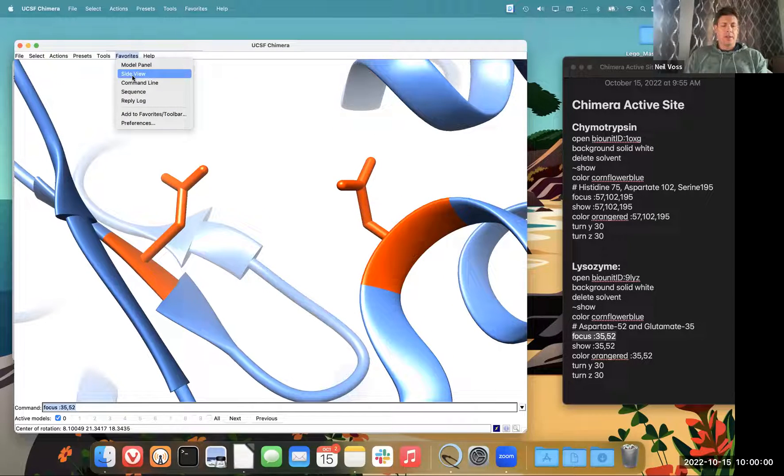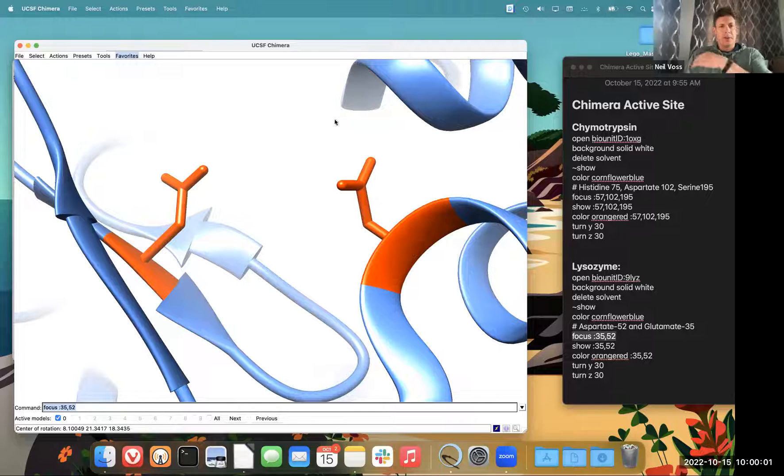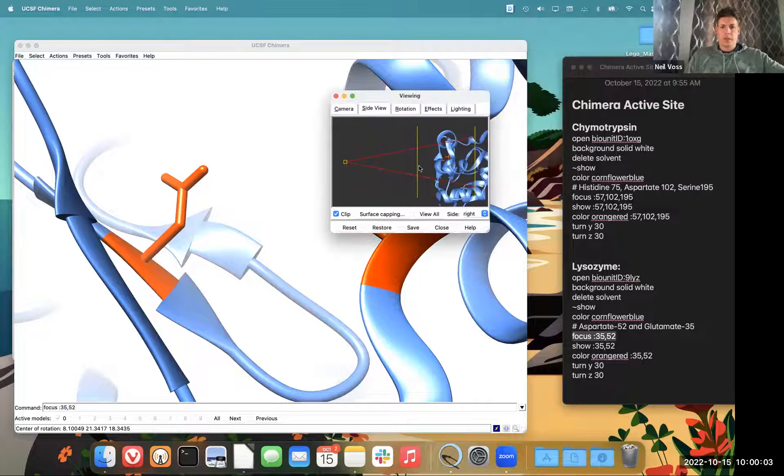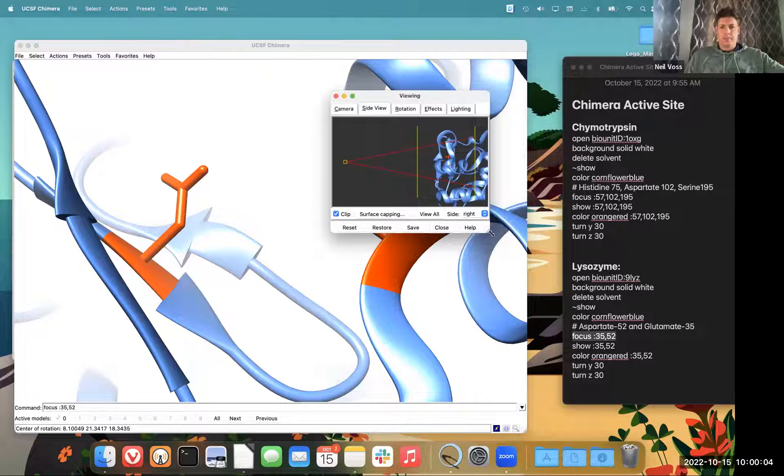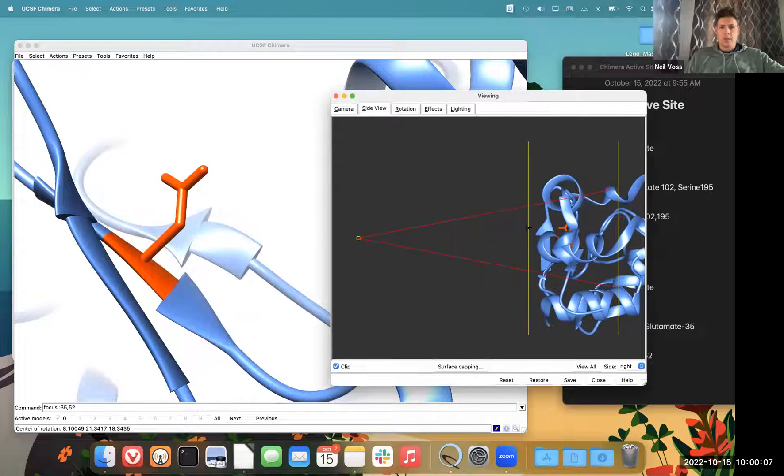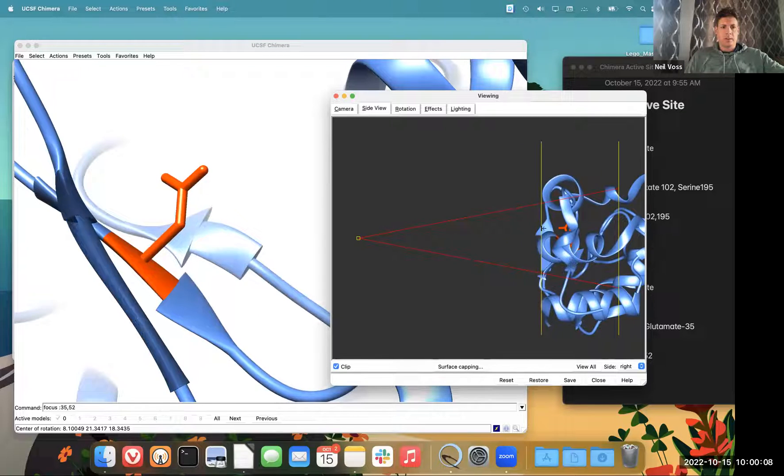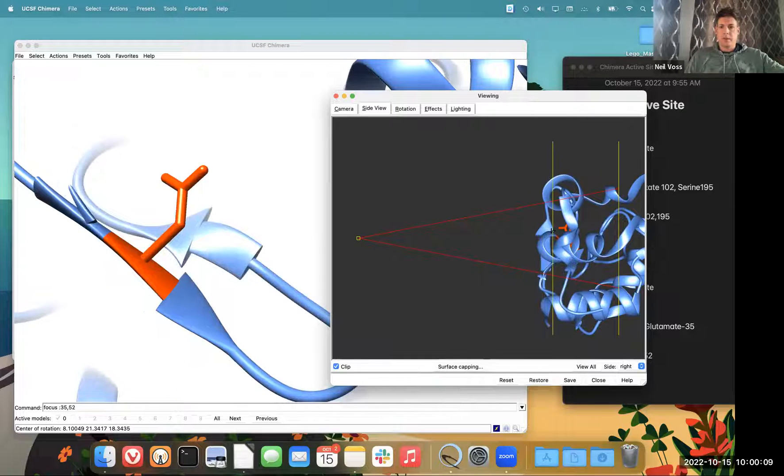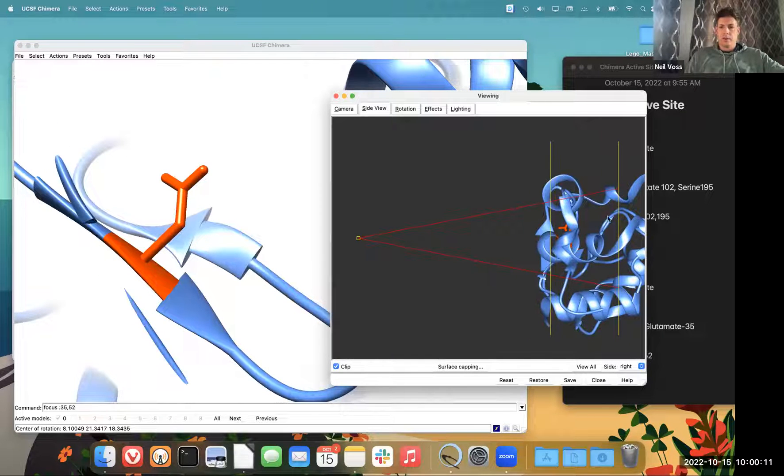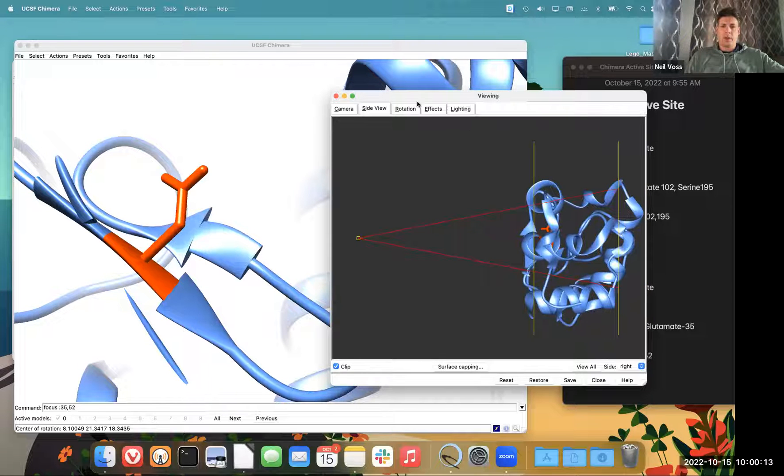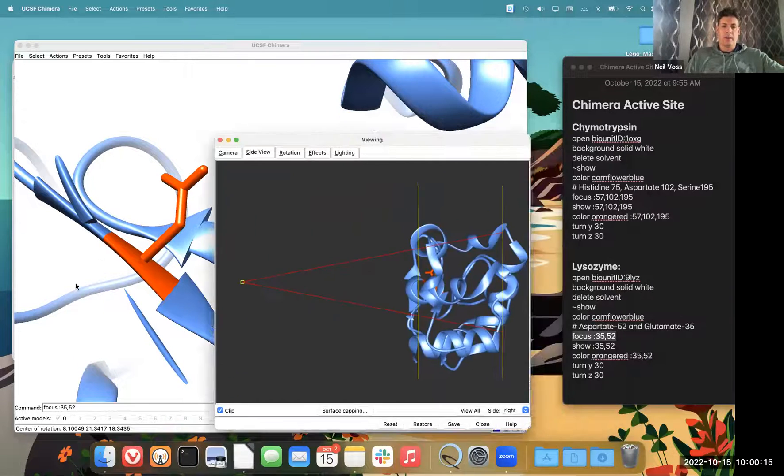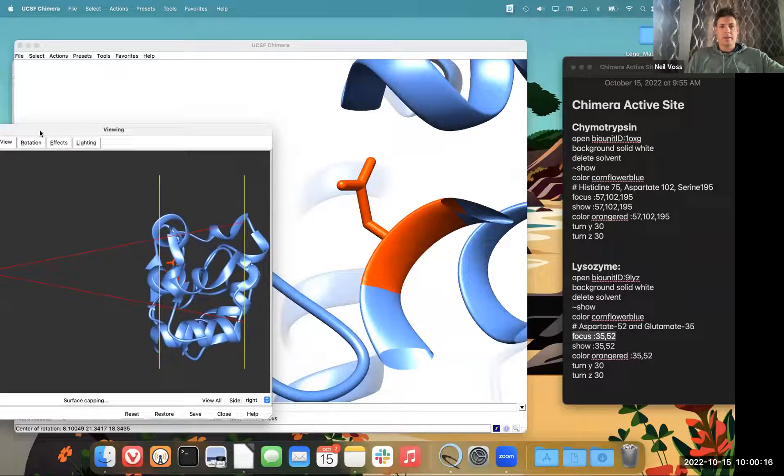And the last thing I like to do, I don't have a good command line for this, but it's the side view system here. And what I do is I kind of zoom in here. I can get rid of anything in front. But I definitely want to decide whether or not I want to keep the stuff behind my amino acids.